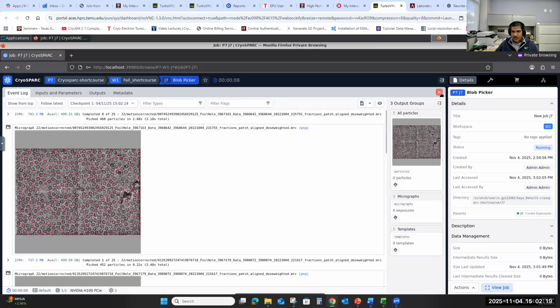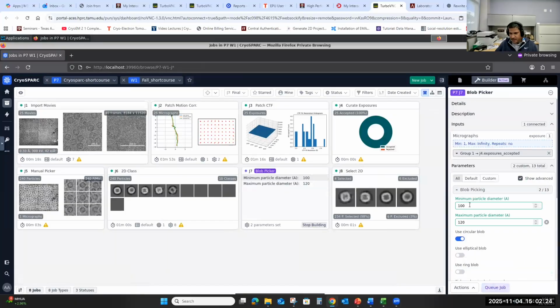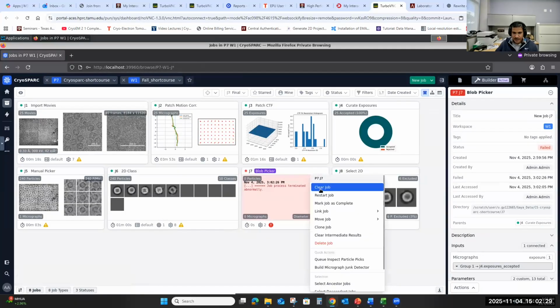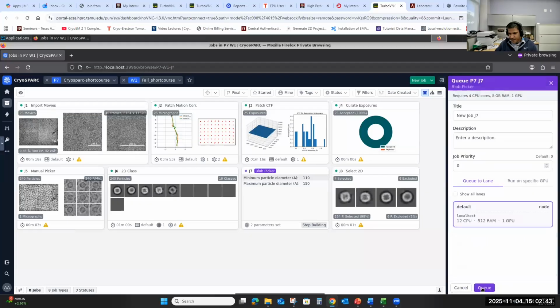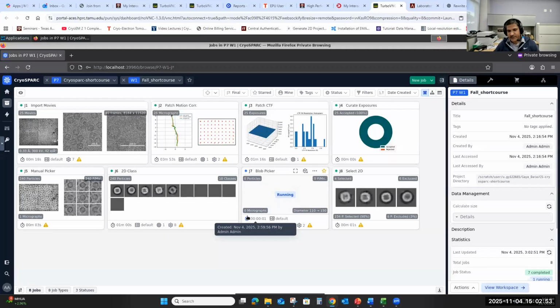So you can see it's going to, no, it makes it worse. So clear, build, let's say 100, clear, stop building. So let's say 150, 110. So you have to do some back and forth processing to center the particles. Once you find that, then you can run.